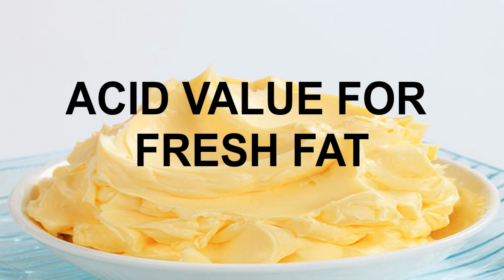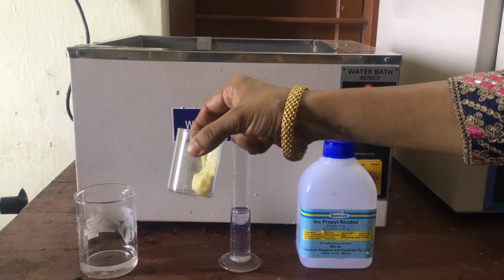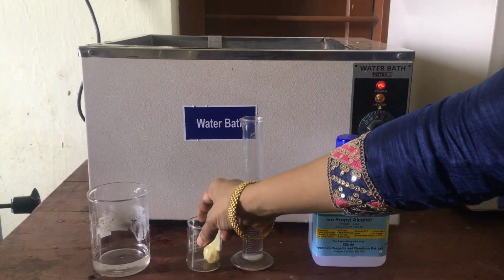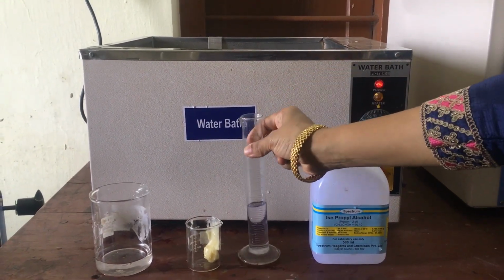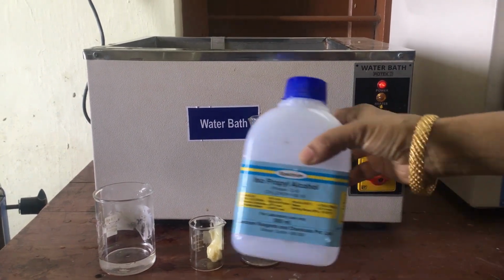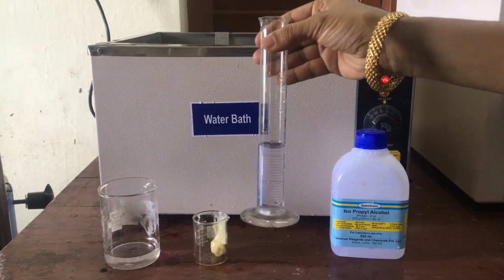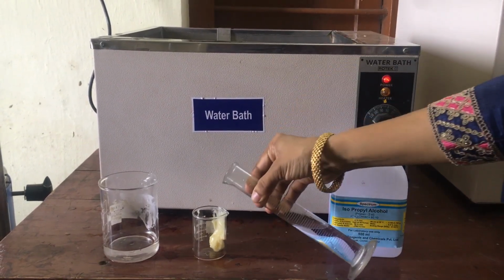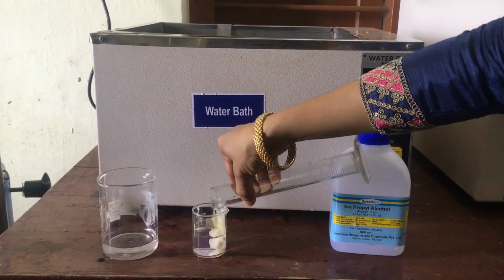First we are going to find out the acid value for fresh fat. Here I have taken 5 gram weighed fresh butter, and to this butter we have to add 25 ml of isopropyl alcohol. I have already measured 25 ml, and I'm going to add this to the weighed 5 gram of fresh butter.